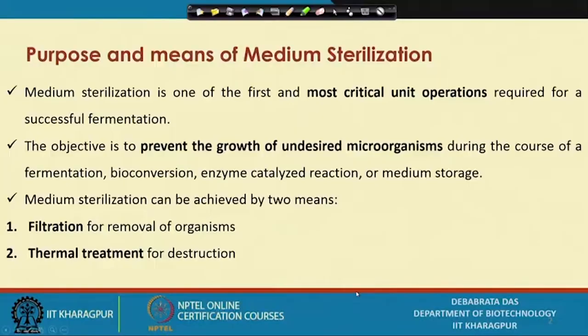Let me repeat again that the purpose of sterilization is to allow your desired organism to grow, and that is why you want to make the environment totally free from other organisms, so that your desired organism can grow. Now, what is the purpose of medium sterilization?